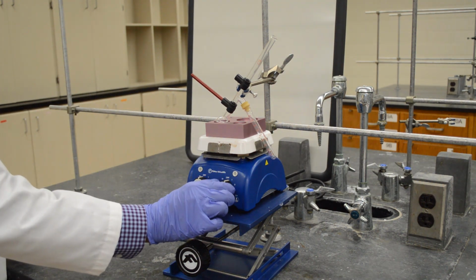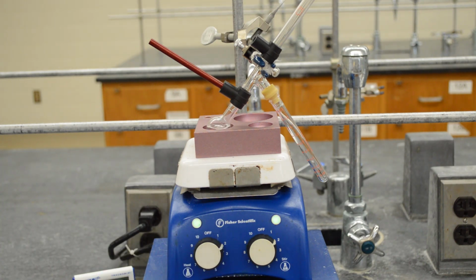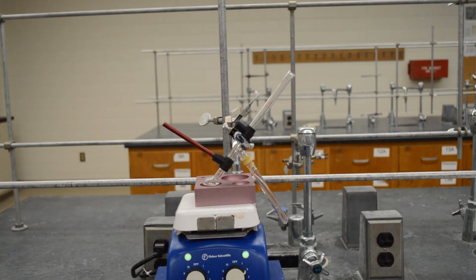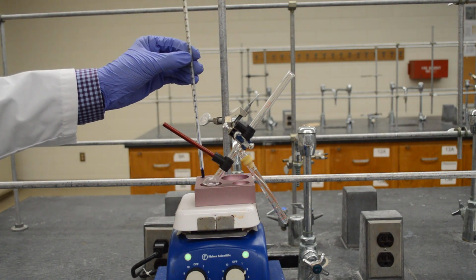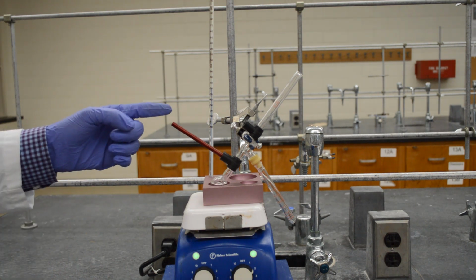I'm going to turn on the stirring and heating. Once it has started boiling, we should turn on the timer. To monitor the temperature, I'm going to place a 220 thermometer on the heating block. The temperature is still at 60.